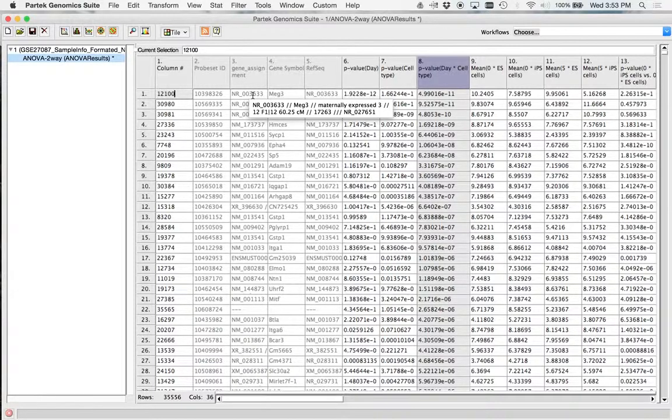Remember, these are from different cell types. What's happening is there's probably a gene that gets expressed in certain cells. So here's what happens with DNA: when your mom gives you your DNA, or your dad, a lot of times whatever they have compressed will stay compressed. This is one of these genes where it has that variable position. So what's probably happening is this is an area where in some individuals it's more compressed. That means you don't get as much gene expression, and in some areas it's more wide open, which makes sense for this kind of cell type. I think this is awesome.